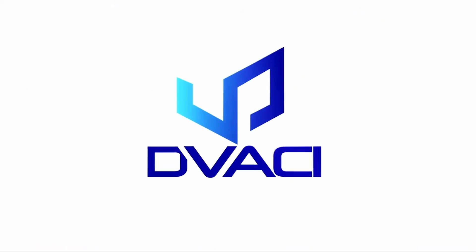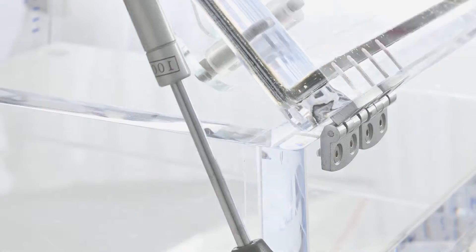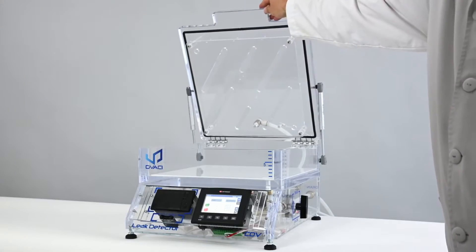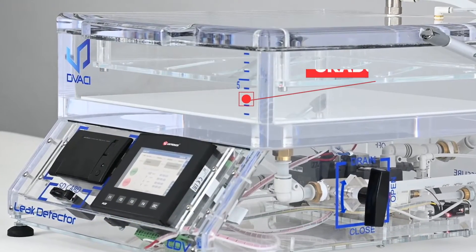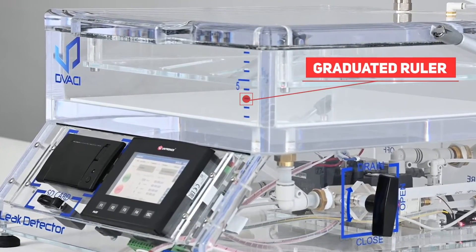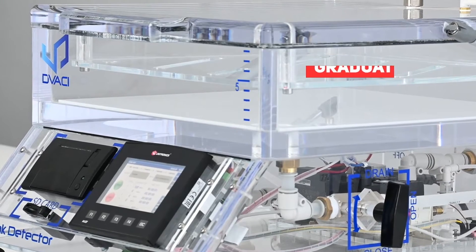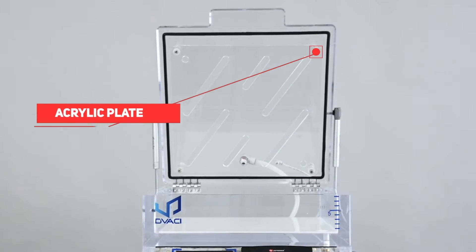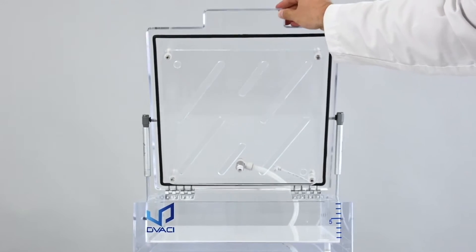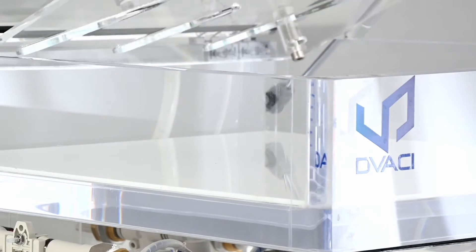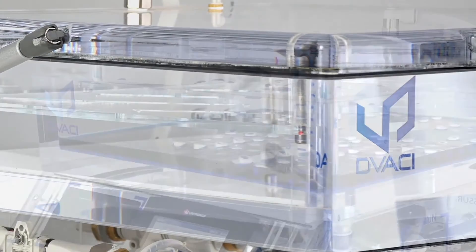The dimensions of the vacuum chamber have been specifically designed to optimize the amount of dye necessary to submerge the samples. A ruler graduated in centimeters will help you determine the amount of liquid for each test. By placing the acrylic plate at its lowest setting, only 1 liter of liquid will be necessary to submerge the packaging within a height less than 1.5 centimeters.